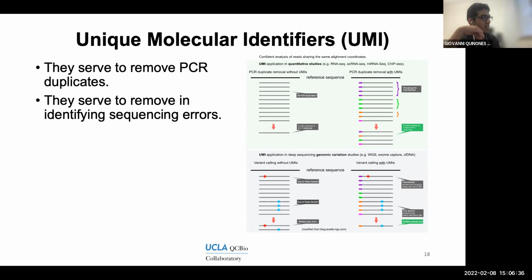There is hybridization, but it's not hybridizing to the RNA molecule itself, so it's not discriminating based on the sequence. In theory, you'll have one UMI for one unique molecule. And as long as there are two different molecules, they'll have two different UMIs, regardless of how similar they are to each other.